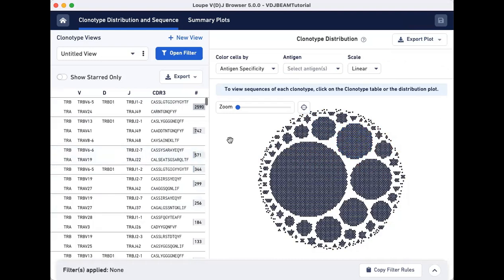We're only interested in clonotypes that have a high antigen specificity score for the SARS-CoV-2 antigen, so let's filter out the non-COVID clonotypes from this list.